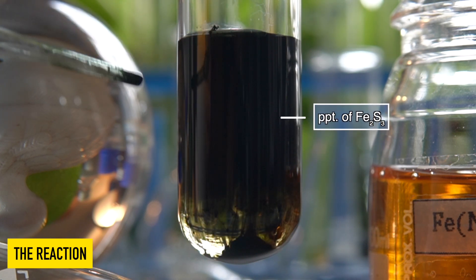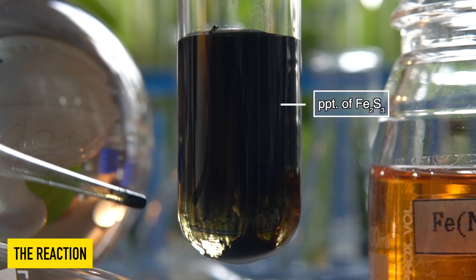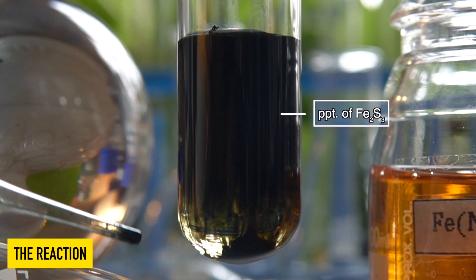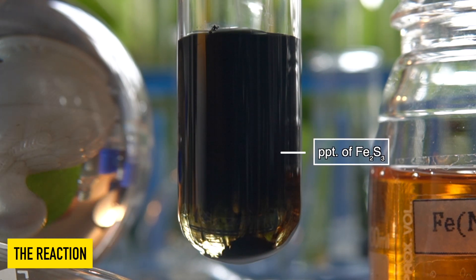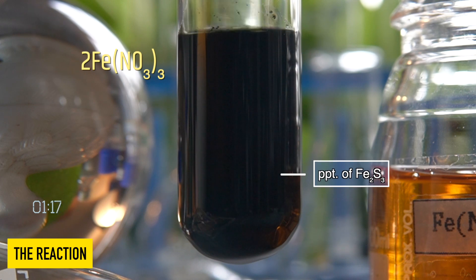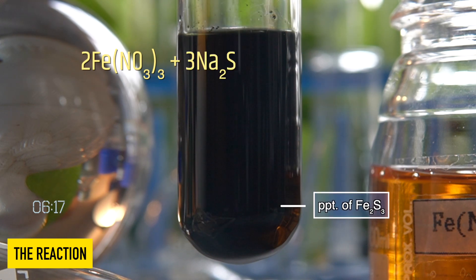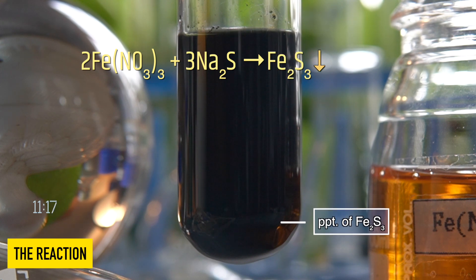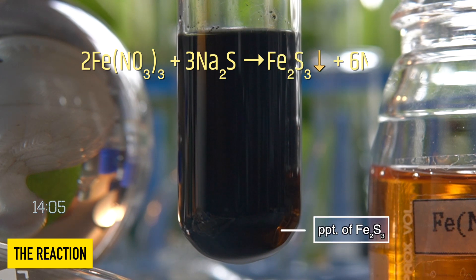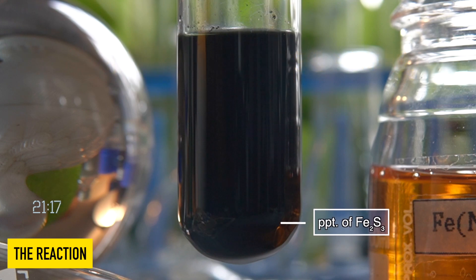The black precipitate that has formed inside the test tube is nothing but iron 3 sulfide. In this reaction, aqueous solution of iron 3 nitrate reacts with aqueous solution of sodium sulfide to produce a black precipitate of iron 3 sulfide along with sodium nitrate.